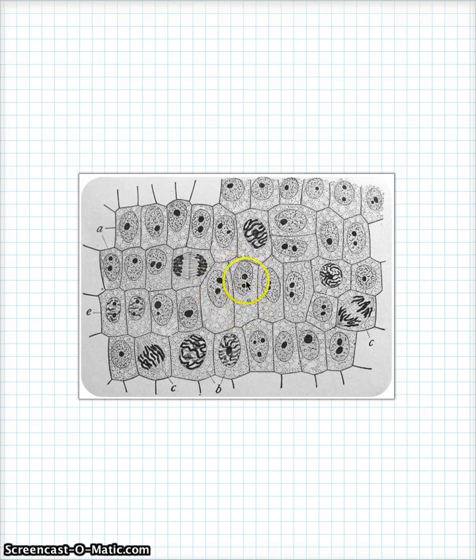So, here's interphase and interphase and interphase. Anytime you see just one little small dark spot in the nucleus, we know that it's an interphase. That's the nucleolus that you're looking at. And sometimes they have two, and that's okay. These are plant cells. We know they're plant cells because you can see the cell wall. That makes it, for some reason, people think that plant cells are easier to determine what phase of mitosis they're in. So, interphase, interphase, interphase, interphase, interphase, lots of interphase.